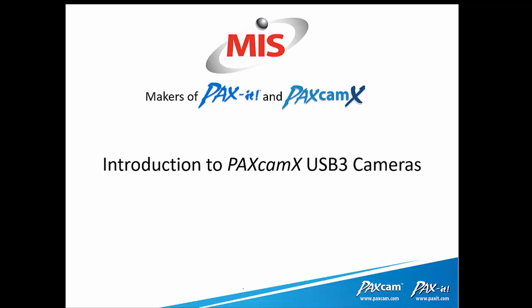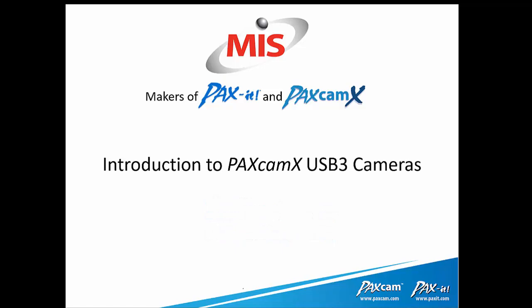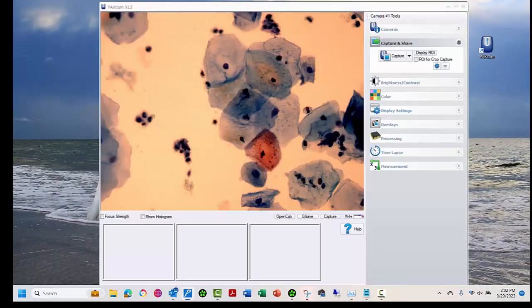Hello, and welcome to this short video describing use of the PAXcamX camera series, including the PAXcam X3, PAXcam X5, and PAXcam X12 models. I'm using the PAXcam X12 today for this demonstration. You should have a PAXcam icon on your desktop. Click that to open the camera.